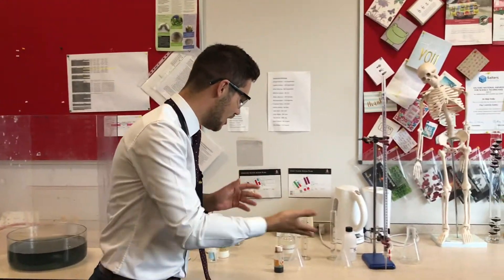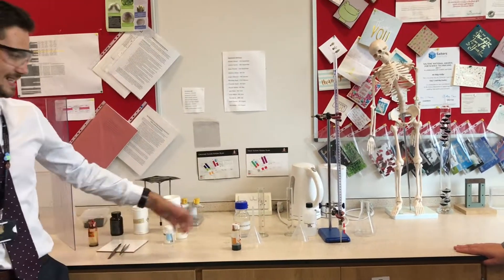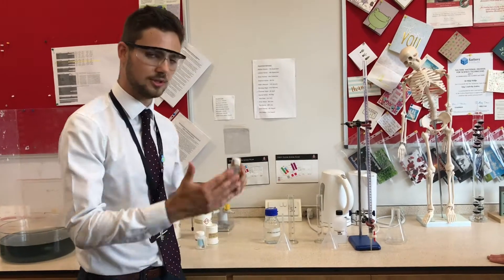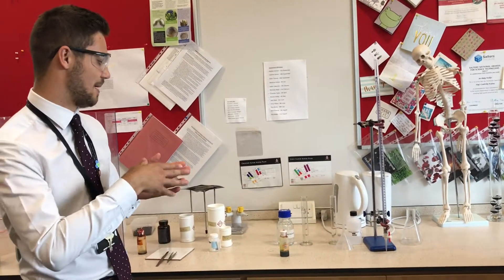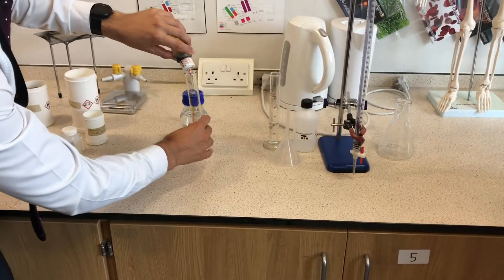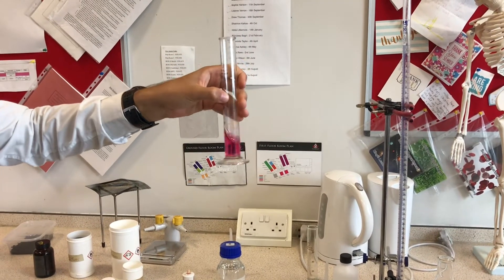Nice to see you all again. What I've got in front of me here is hydrochloric acid and sodium carbonate — so an acid and an alkali. I'm going to prove that immediately by adding some universal indicator. As we know, neutral is green. I'm just going to add a couple of drops in there, swirl that around for a good mix, and you can see that nice red colour coming through the solution.